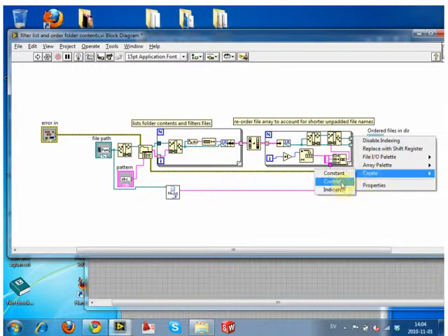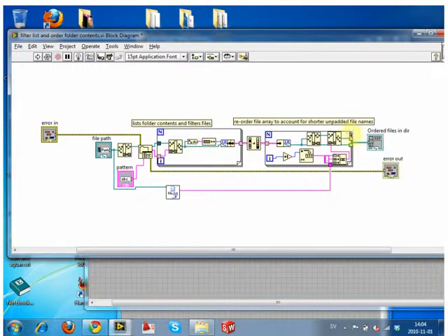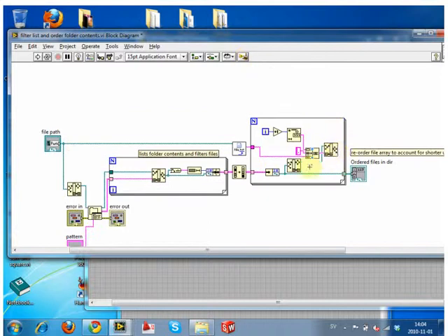We don't actually need to create an indicator, but now what we're doing is we've come up with our own naming scheme for these files as they're coming out. Right now nothing's been opened, nothing's been created or destroyed. All we're doing is looking at file names. Using this switcheroo thing, it orders the file names in order and reads the file location in. Once it's got the location, it goes, okay, I don't need your file name anymore because I'm going to put mine in there. We're creating a new file name, just a simple number, based on what number in the list that file is.